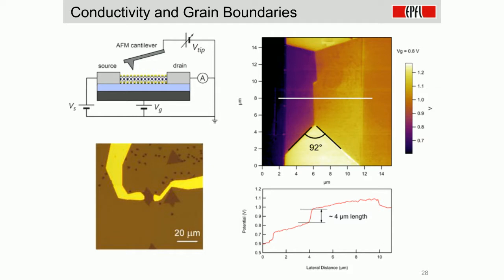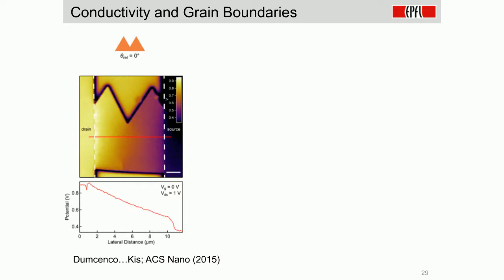So if you take a material with a lot of these grain boundaries, then from the electrical point of view, it would appear to be much, much longer and more resistive than it would be without these grain boundaries. So now, when we saw that this method works pretty well, we used it on the highly symmetric lattice relative orientations that we got in our grown film.